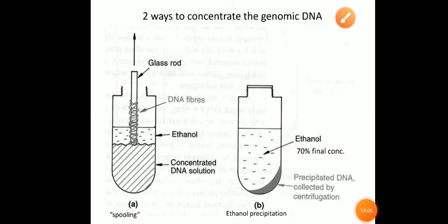Now, how is it practically done? In our laboratory, we generally isolate DNA by using the kit that is specially provided by HiMedia Laboratories Limited. So, next time I will explain how to isolate genomic DNA by using the HiMedia experimental kit.